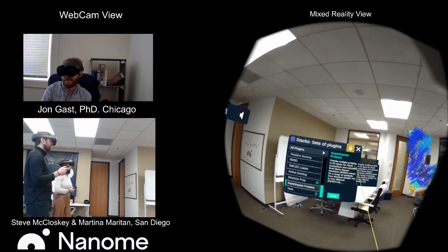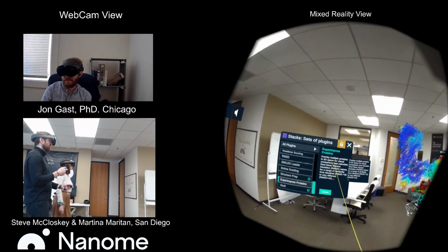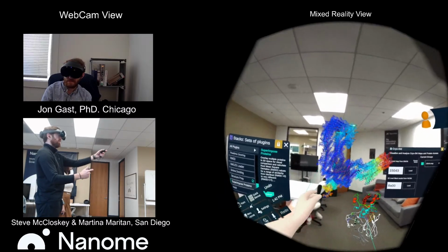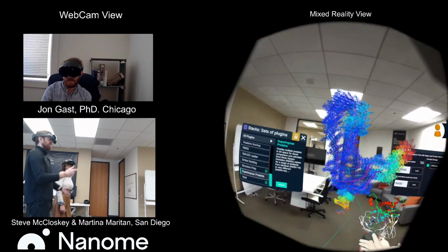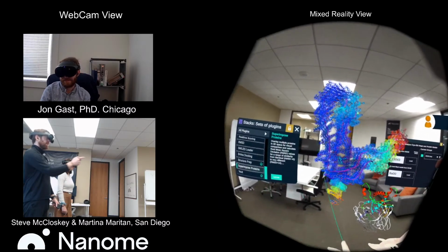Where this allows you to overlay multiple proteins in 3D space and compare them. So if you do have a map and you have another structure and you wanted to overlay them and compare, that could also be another really great complement.